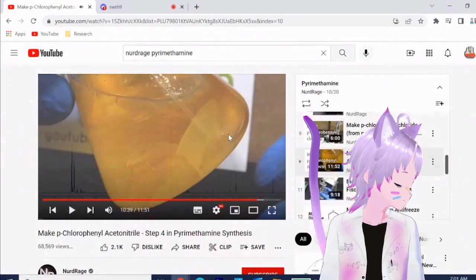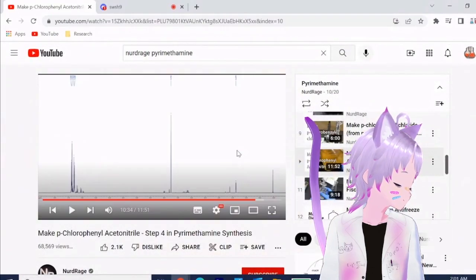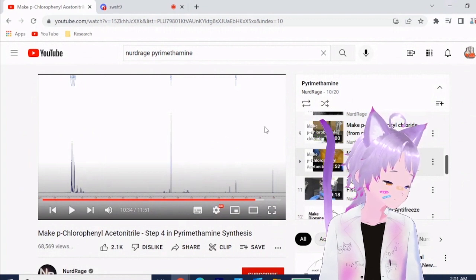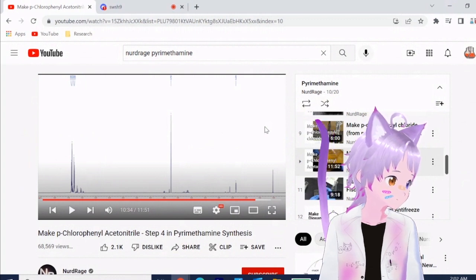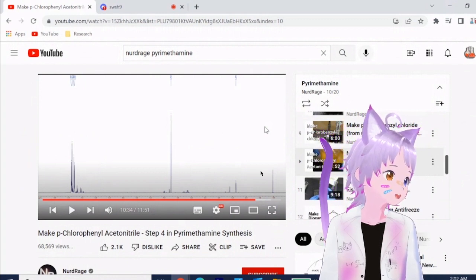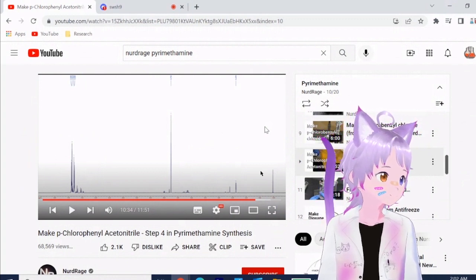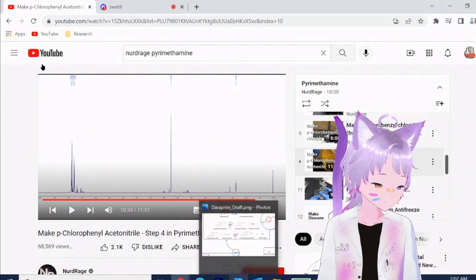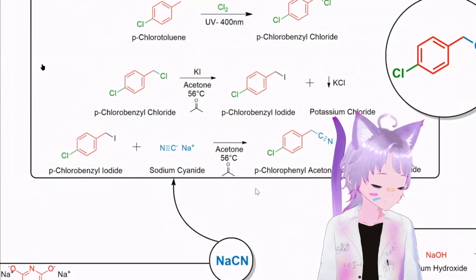Oh no, this was the wrong one. I don't know how to read NMR spectrum, but I thought this one here would be acetone, and in a comment on his last video, acetone was a sort of impurity. Someone said that they use acetone to clean NMR tubes sometimes, and it can show up in spectrums. Ah. So, yeah. Anyhow, I guess moving on.